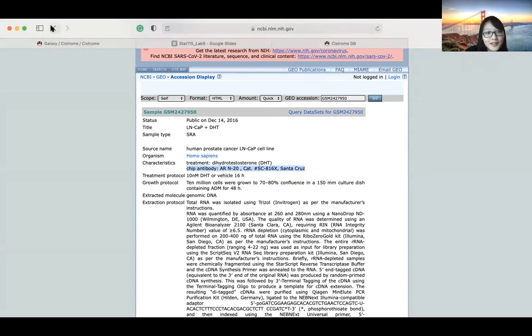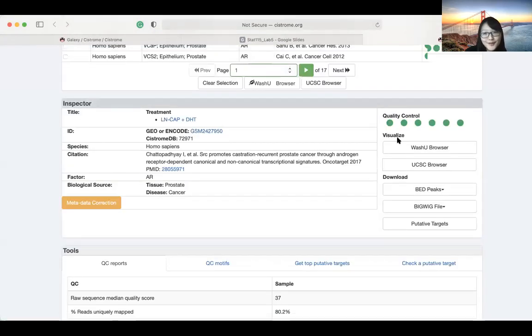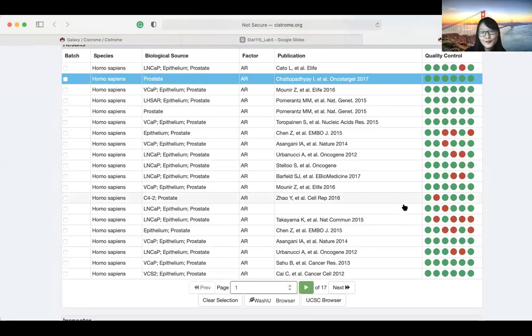You can also look around and check some bad quality ones and see whether the ChIP-seq quality is related to the antibody company, or maybe to some specific product, or maybe not. Again, this is a free response question. You can just give your thoughts here, and we're open to any answer.